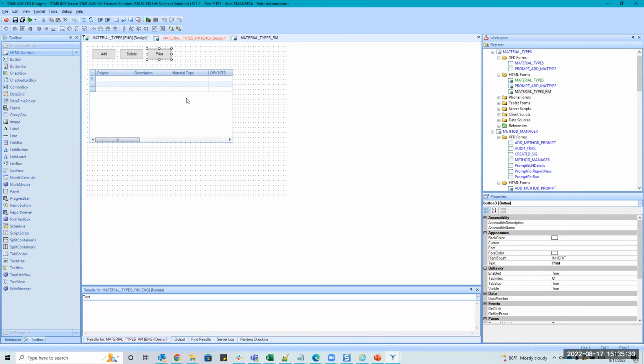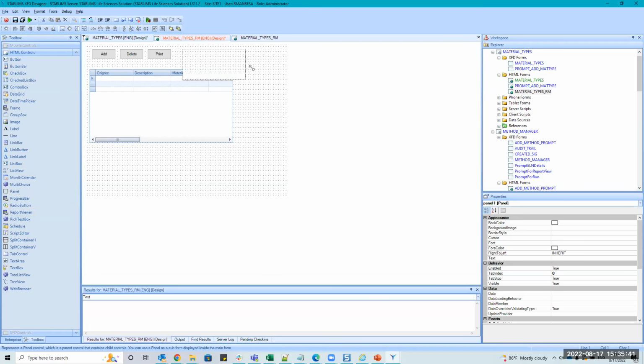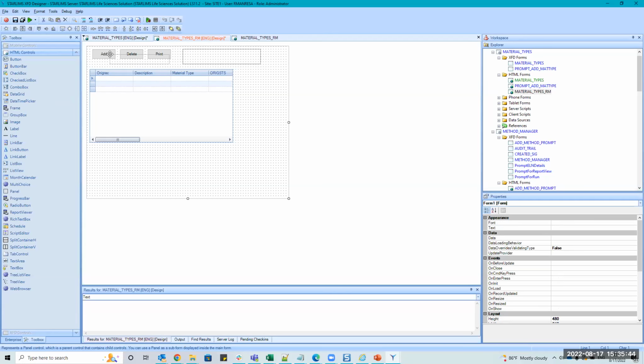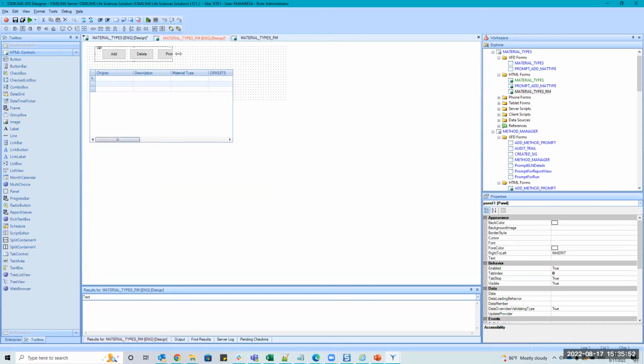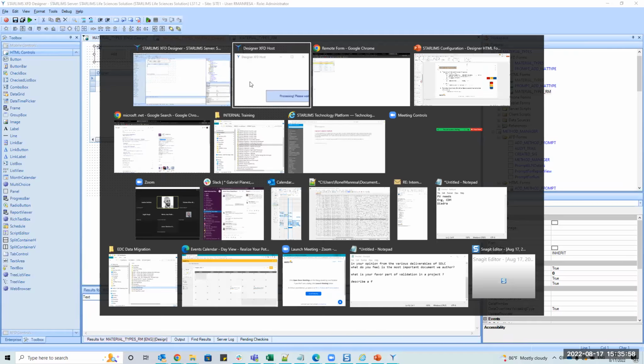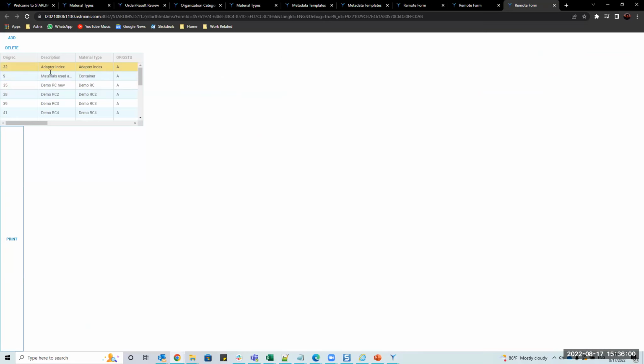So it matters in the order of the controls, and it's kind of complicated, to be honest, the way this works. So that's why I said practice of these patterns is key, right? So what we typically do is for the buttons, we put them in a panel. That way you're dealing with fewer controls, okay? And hopefully things start aligning, right? So now what I suspect is going to happen maybe is the grid at the top and then the panels at the bottom. Let's see.